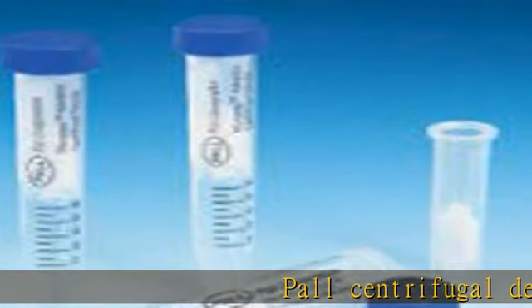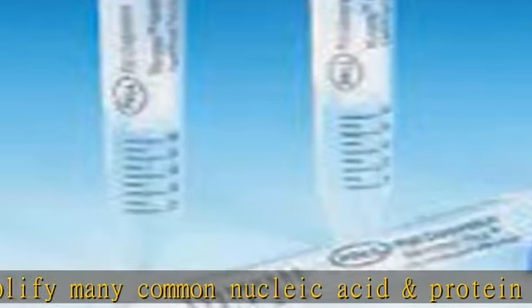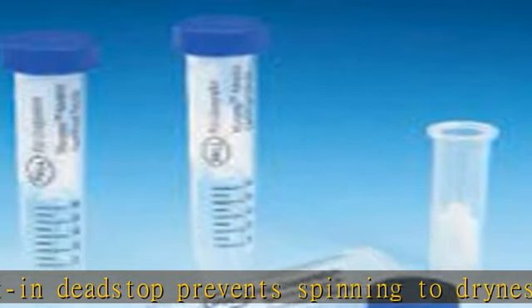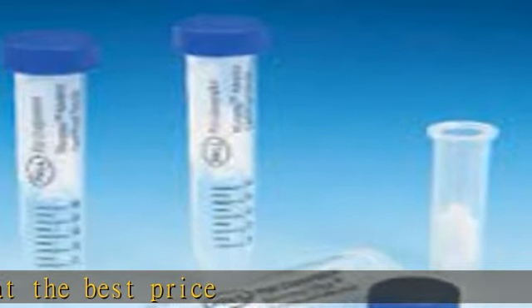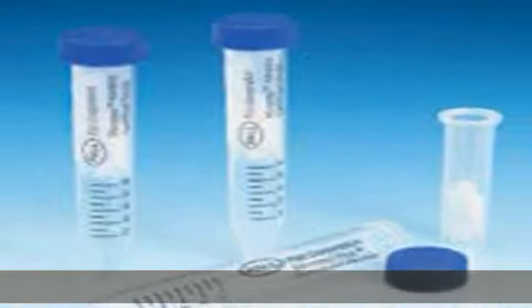Pall Centrifugal Devices simplify many common nucleic acid and protein sample preparation procedures. Built-in dead stop prevents spinning to dryness. Color coded for easy identification. Check the description to get this product today at the best price.